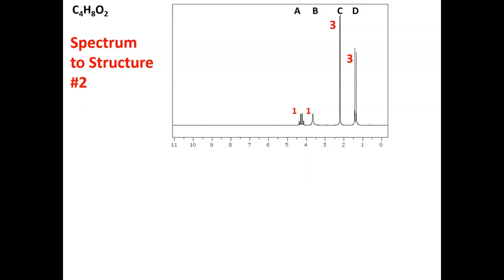And as you can confirm from the molecular formula at the top left, there are indeed 8 H's. There are also 8 H's from the integration values. So create your analytical table: peaks, integration, and shift values, splitting patterns and assignment, for the 4 peaks.